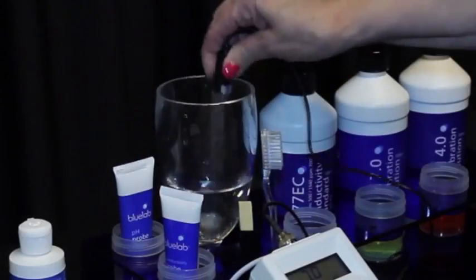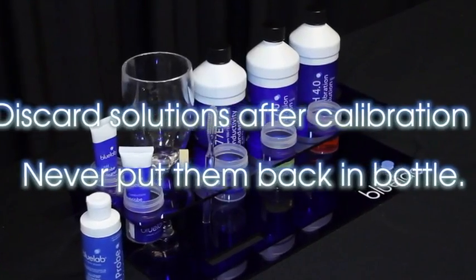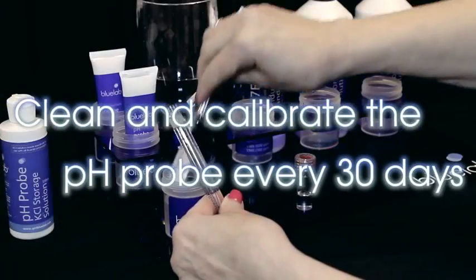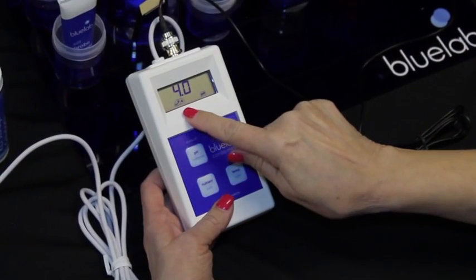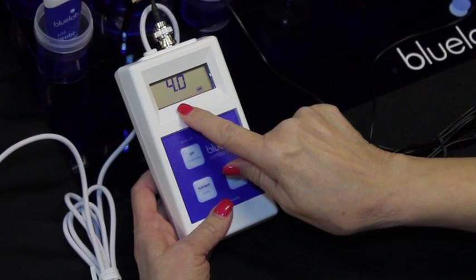Rinse the probe in clean tap water and discard all used solution after calibration. Never put them back in the bottle as you will contaminate the solution. Clean and calibrate the pH probe each month to ensure accurate readings. The calibration indicators will disappear one month after the last successful calibration to remind you it's time to calibrate again.